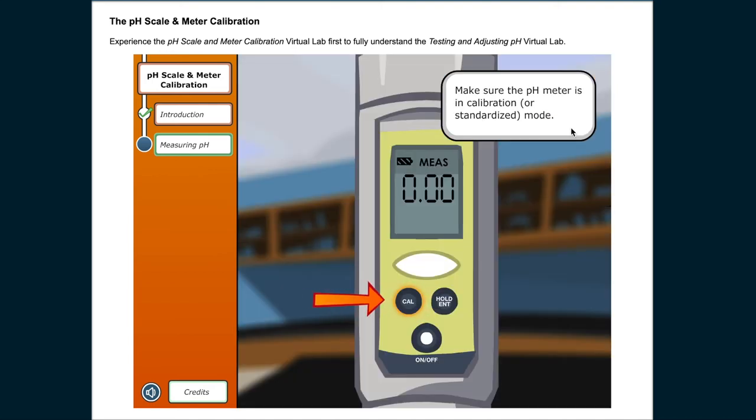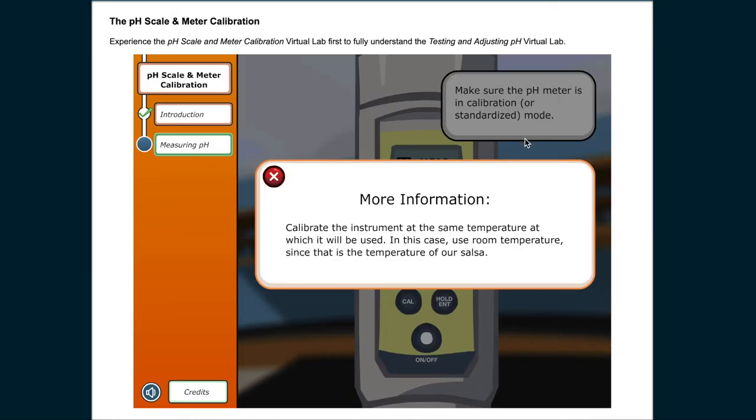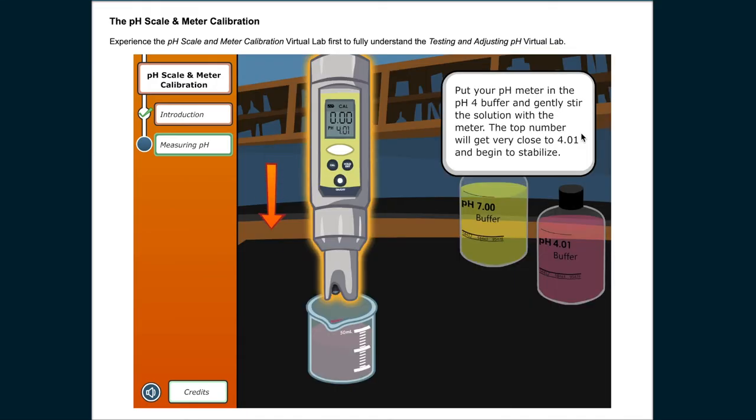Make sure the pH meter is in calibration or standardized mode. Calibrate the instrument at the same temperature at which it will be used. In this case, use room temperature since that is the temperature of our salsa.